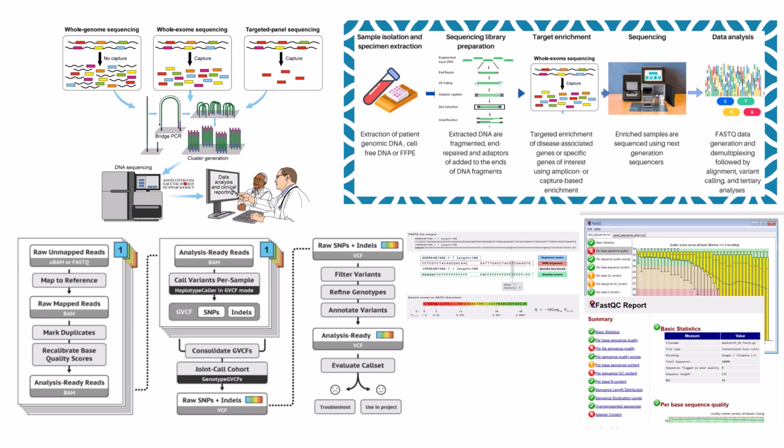Wow. It's like fine-tuning the confidence meter for every single letter based on known issues. That's exactly what it is. And it makes a huge difference later when you're trying to decide if a small difference you see is real or just a sequencing error. It dramatically improves the accuracy of variant calling. I can see why. And then typically there's a final quality check, sometimes using GATK's AnalyzeCovariates, just to confirm that the recalibration step actually worked as expected, that the quality scores look better, and the data is truly primed for the next big step, finding the actual variations.